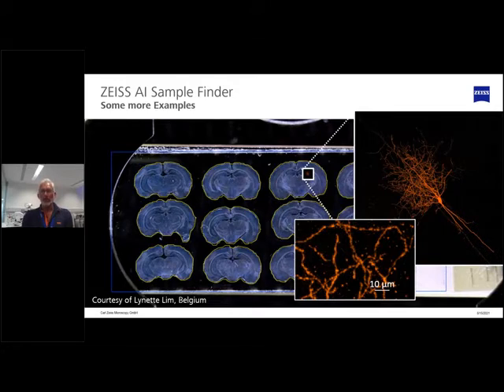And last but not least, this is a slide with some translucent cross sections of a mouse brain. We don't see them by eye. This unique dark field contrast makes them available. And as we can see here, we do see the outline of the cover slip. We see all of them properly detected. And this is exactly the time where you can switch over into what you really want to do at the end, going with a higher magnification, applying some fluorescence on it, acquiring stacks and all this.